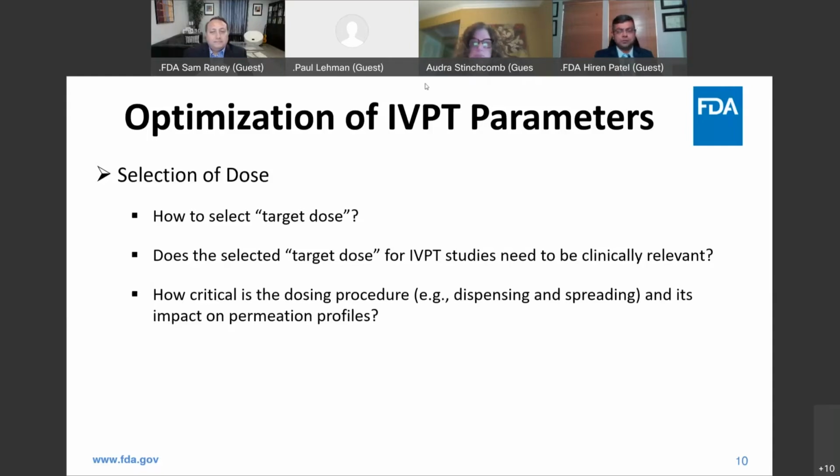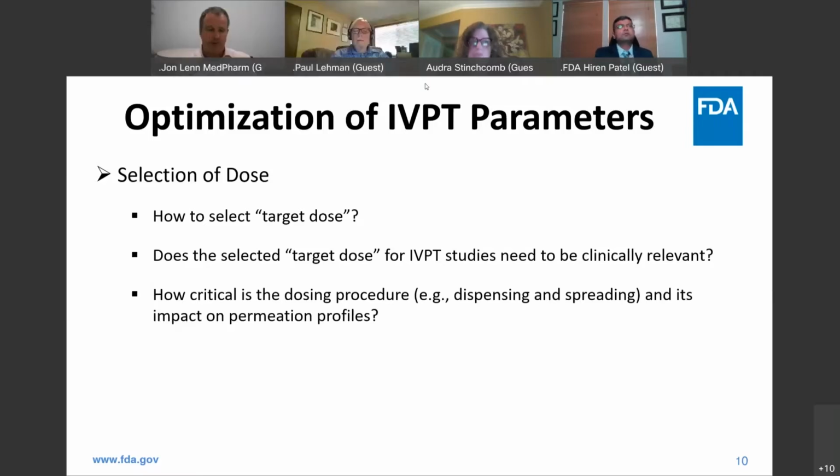Well, some of this can be product specific, because just applying an ointment is a pain. Certain ways work very well for solutions or less viscous formulations. You can drop it on there with a positive displacement pipette. If you're doing that, be careful about rubbing it onto the skin with those little tips, because you can damage it. So ideally, if you can come up with a procedure that is accurate across different product types, allows a little bit of shearing, and controls the dose to well-controlled volumes or weights, that's ideal.